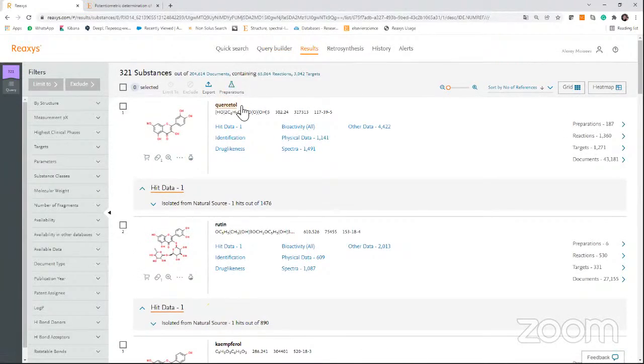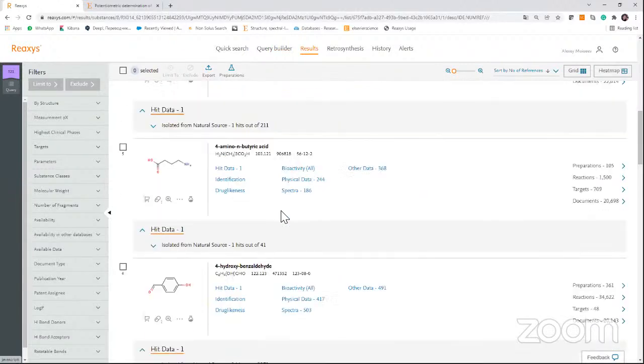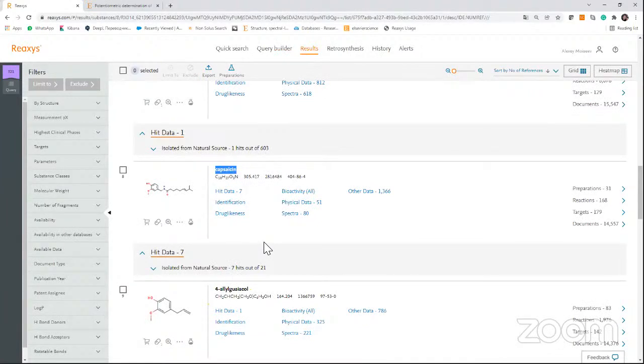So you understand what else is in this matrix, how to create your analytical experiment, how to do purification, to remove all the substances which do not allow you to see your capsaicin by spectroscopy, or other compound, and there are a lot of possibilities to use it.